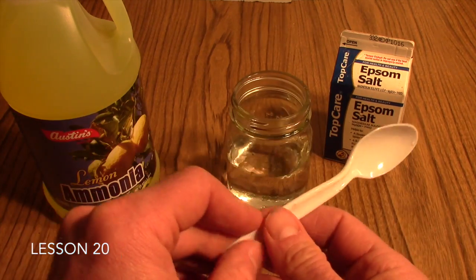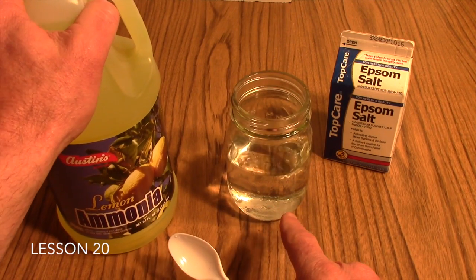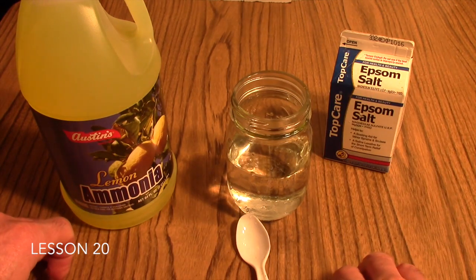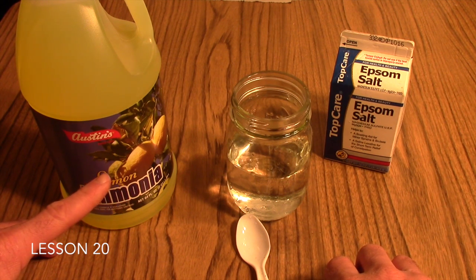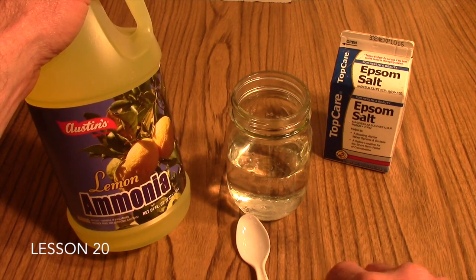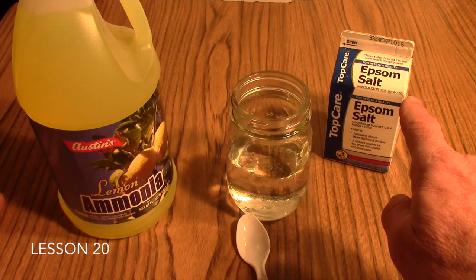The next step will involve adding the ammonia to the Epsom salt solution. Your students will want to take approximately no more than a fourth of a cup of ammonia and add it to the Epsom salt. Note that the ammonia does have a strong odor — some students may be sensitive to that, as it tends to open up one's nasal passages — so just be aware that may happen.